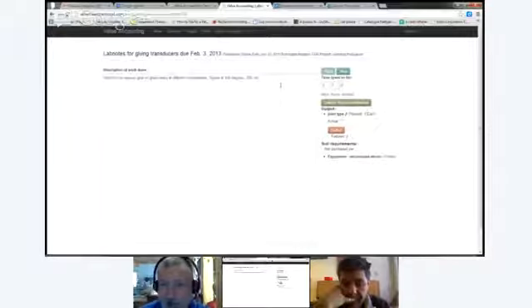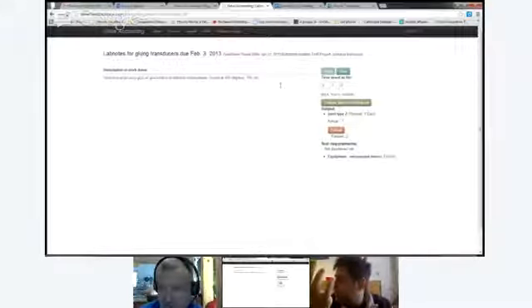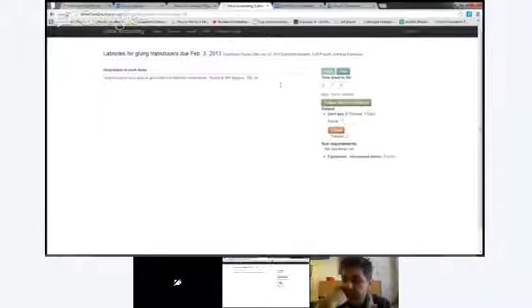I have a comment here, Bob. What is the data type of the output of a project? It is a resource. It goes into inventory. What if the R&D project doesn't have an output, an object which could be represented by a number, 1 or 2 or 3 of them? What if the R&D project is to improve a process, and now you can't represent that by a number? Okay, it's pass or fail, or is a certain improvement of what was there before?